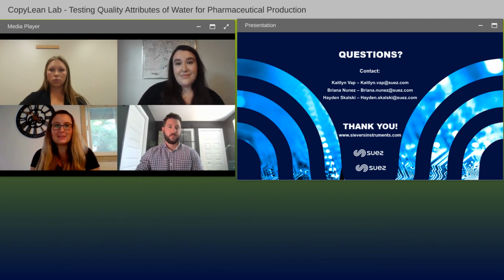Awesome. Thank you. We are down to our last question. If you have any that you would like to ask, please go ahead and submit them now, as we do still have a little bit of time left, and we'll make sure to get those covered. Hayden, this last question is for you. How much sample volume and how much LAL reagent volume is needed for each sample replicate with the Sievers Eclipse?